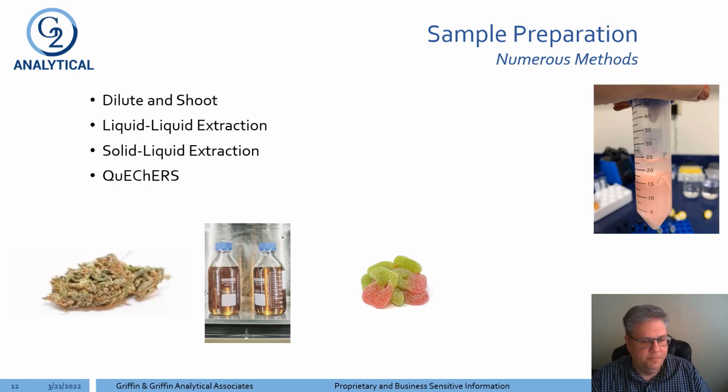This is raw material, bud material, if you like, plant material. This is a concentrate, a distillate that is full spectrum. So these are very high concentrations, very thick, the consistency of honey. And then everything over here, all the way over here, is a final product. These are Delta 8 gummies that we tested. So this has Delta 8 in them.